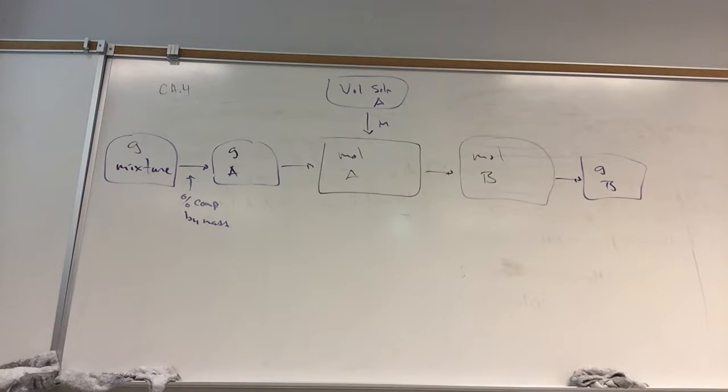So we take a concentrated chromate solution, and you measure out a volume of concentrated, and then you dilute it. This is called a volumetric flask. And what we do is we carefully dilute it up to the line. There's a calibration line here, and this delivers 250.00 milliliters. It's designed to contain. And so we just add water until we hit the 250 and then shake. Actually, we try to shake it before we fill it, because once you fill it up to here, it's hard to agitate the solution. And so this is called solution dilution.